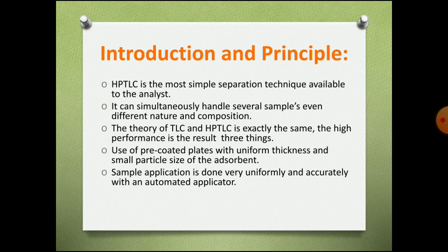Sample application is done very uniformly and accurately with an automated applicator. In HPTLC, an instrument is used to apply the sample on the pre-coated plate, but in TLC we use a small capillary for spotting the sample material.